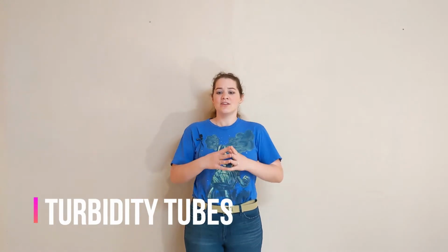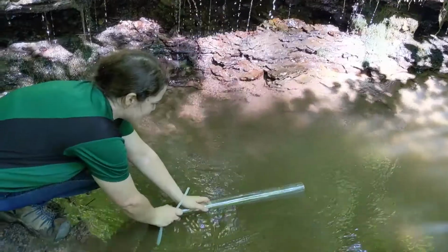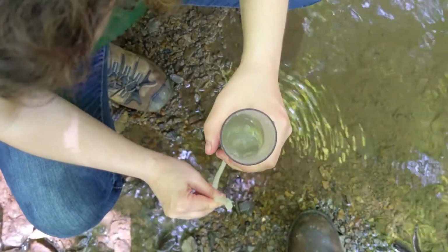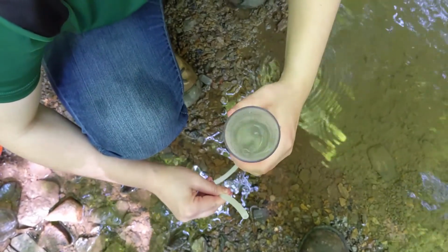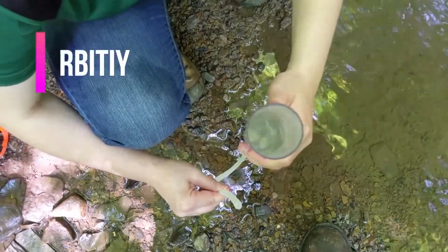We look at the amount of sediment in rivers in two different ways. First, we use turbidity tubes. These are long tubes with a small black and white marker called a Secchi disc at the bottom. We fill these tubes with water from the river. Then, a person observes the tube and slowly releases water from it until the black and white marker becomes visible. When the marker becomes visible, we stop releasing the water and read how much water remains in the tube. This gives us the transparency of the water, also known as turbidity. These tubes are a great way to measure sediments, and they can be used in the field.